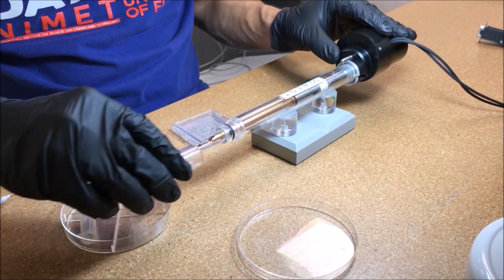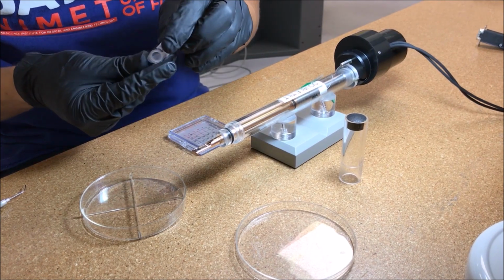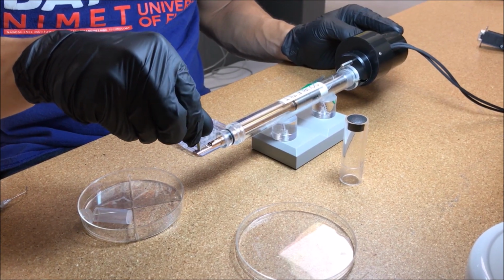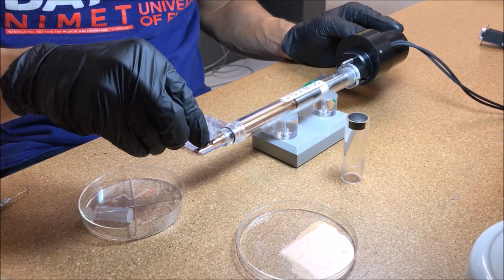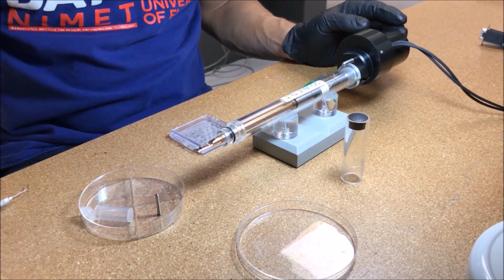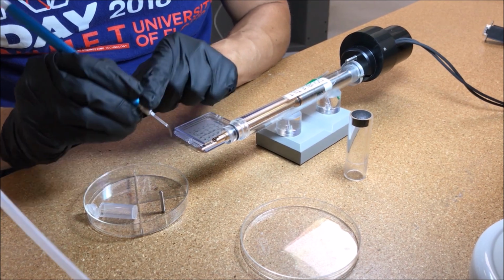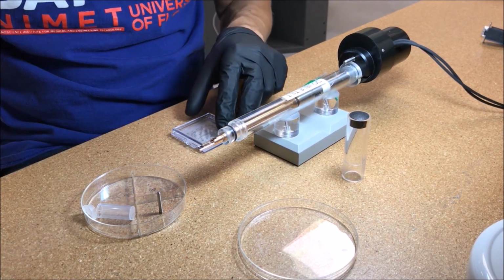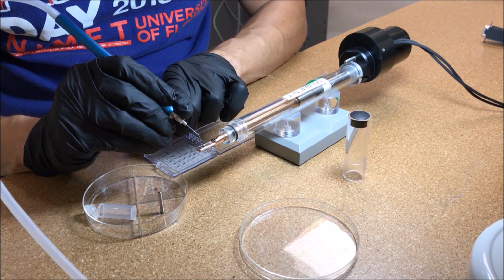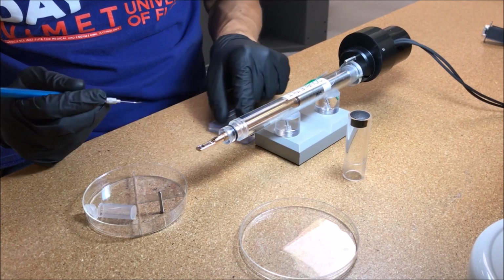To unload the double tilt hex ring holder, remove the plastic protective cap from the support base. Then use the hex ring tool to carefully remove the hex ring by turning counterclockwise. Use the vacuum tweezers to remove the anti-twist washer from the basket, and use the vacuum tweezers to remove the grid from the basket and return it to the gel pack box.